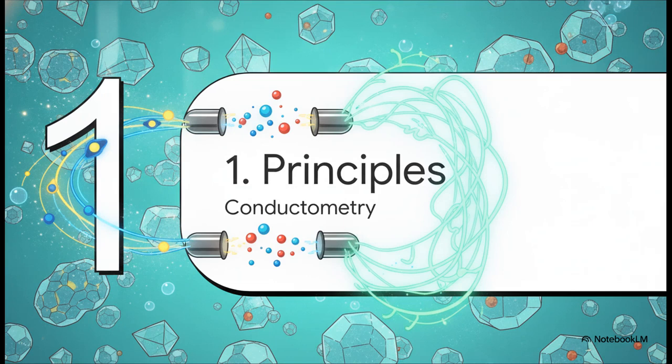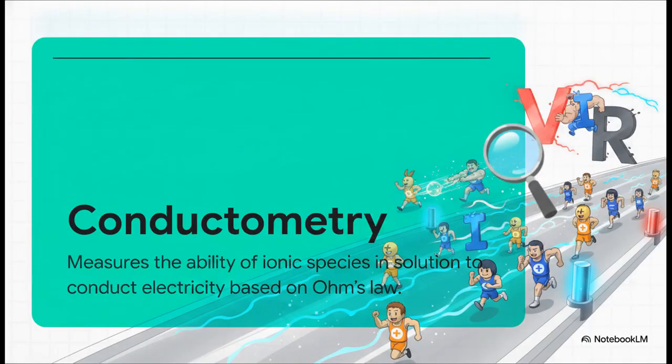Section 1. Principles of conductometry. Let's start our journey today right down at the microscopic level, just to get a handle on the fundamental laws that govern this invisible world. So, conductometry is actually grounded in a really simple concept you might already know: Ohm's law, where conductance is inversely proportional to resistance. But here's the catch.